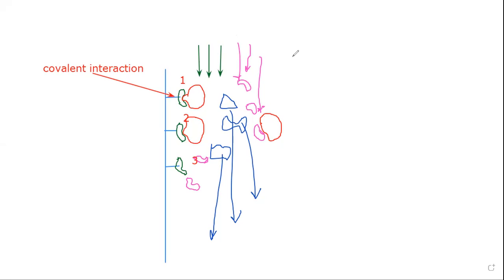That complex is now going to come out of the column because this red color molecule now has no opportunity to bind to the column. The complex will be eluted from the column. It will come out from the outlet of the column. Is that clear? And as we are taking the fractions, probably some successive fractions, maybe fraction number 13, 14, 15, these 3 fractions will contain this complex now: free ligand bound to the desired molecule.